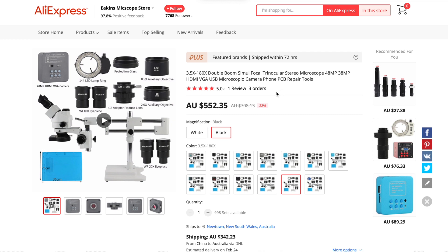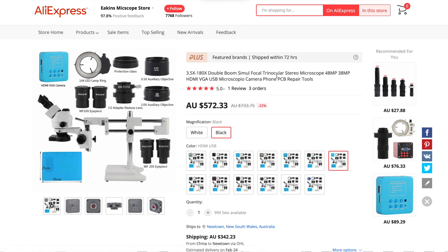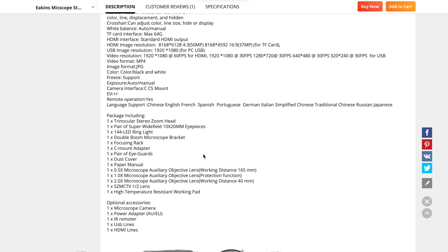So this is the microscope on the AliExpress website and you can see in the top left corner the first thing you see is a picture of the camera, and then all the other pictures they have also show the camera. You'd think it comes with a camera - it even says HDMI camera and so on - but no. When you scroll down to the bottom of the screen, this is what's in the package. If it's not in this list it's not included. Down here: 'optional camera' - optional means not included. You've actually got to go and buy the camera separately.